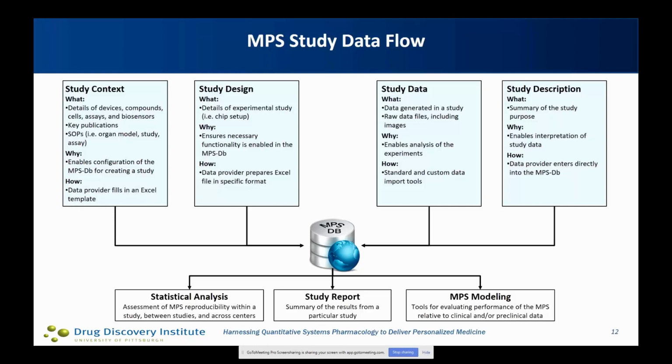And then the study data itself from all of the various assays. In most cases there's a relatively wide range of assays that are run, and the data from all of those assays needs to be associated with the metadata that's relevant to those particular chips and assays, and then stored in the database. And so we manage all of that.